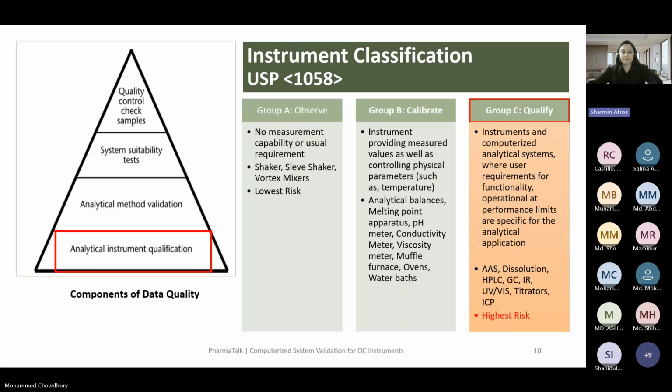For the pH meter and conductivity meter, some companies or organizations perform a routine check, and others perform a periodic check, like after 6 months or 1 year. So what would be the best practice for maintenance of the conductivity meter and pH meter?